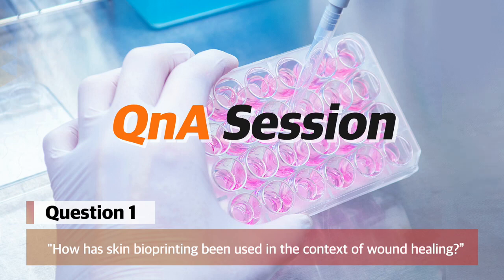But a unique thing about the bioprinter is that its strength not only comes from trying to create a fully differentiated tissue and implanting it, but it also has a strength of simply evenly distributing cells and evenly distributing autologous solutions into a regenerative patch that is minimally manipulated. So you don't have to culture, but you can still apply it to the defect area, expecting regenerative results from these autologous solutions. So the bioprinter can really be thought of as more than just a tissue fabricator, but also a regenerative solution creator for autologous therapies.